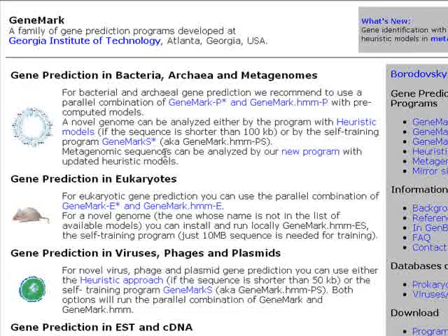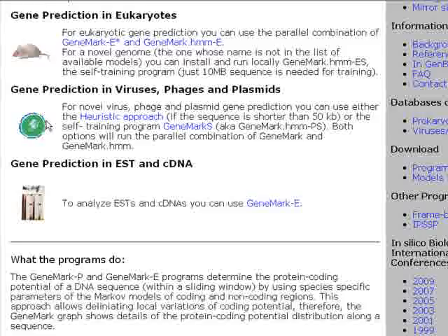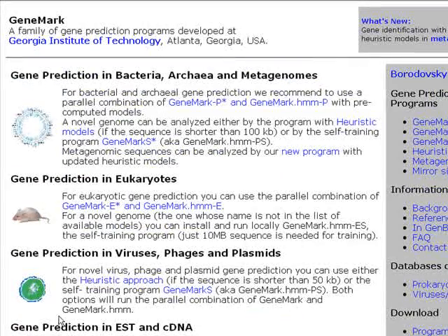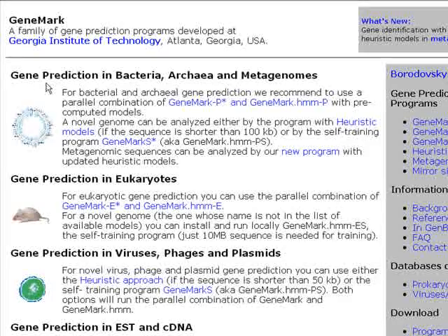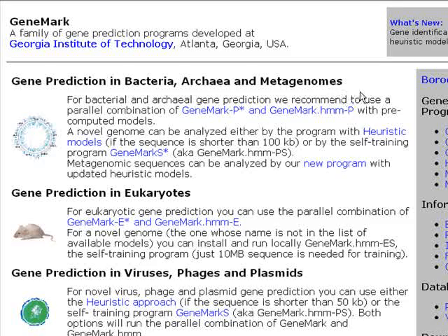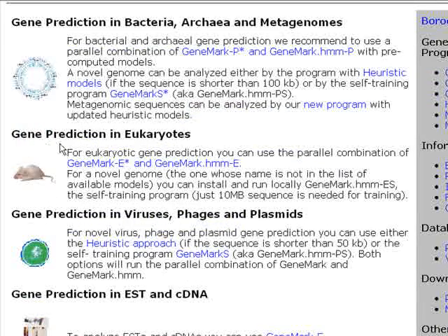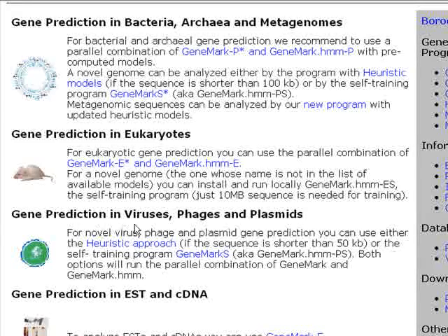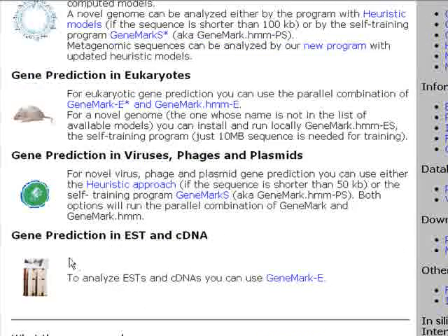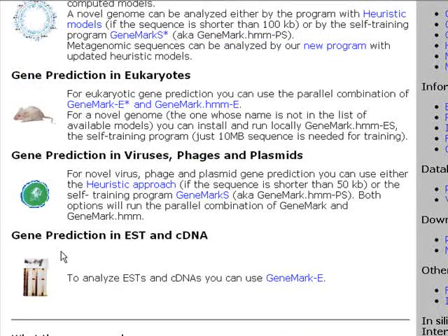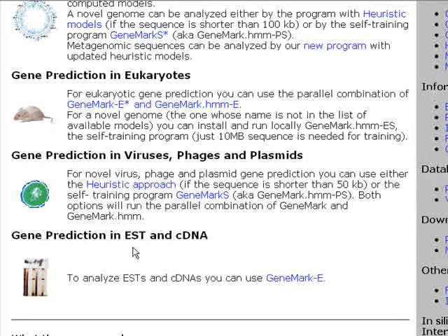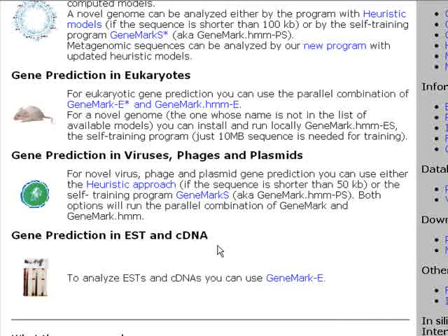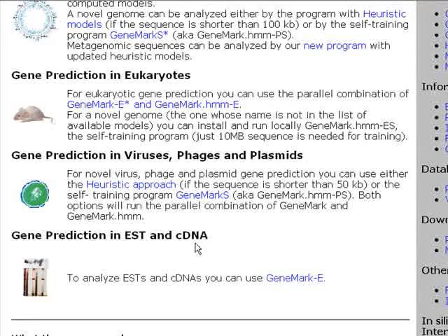This is our main page. We have four choices here or four distinct programs. The first is gene prediction in bacteria, archaea and metagenomes. The second is gene prediction in eukaryotes. The third is gene prediction in viruses, phages and plasmids. And the last choice is a program designed for gene prediction in EST or expressed sequence tags and cDNA which is DNA version of mRNAs.